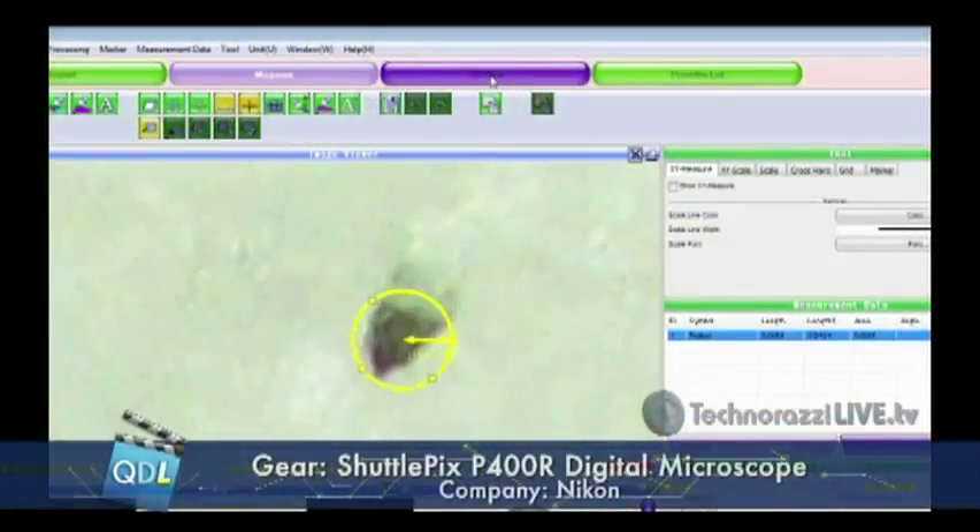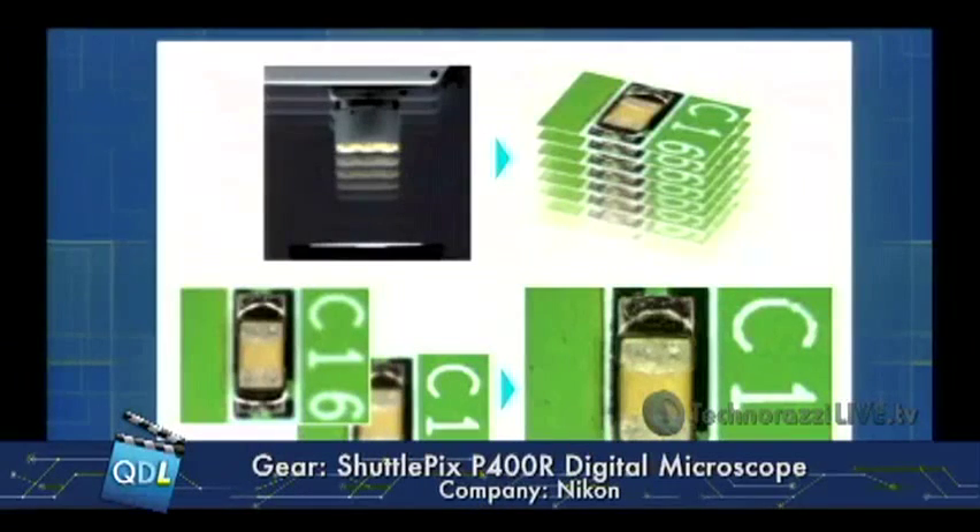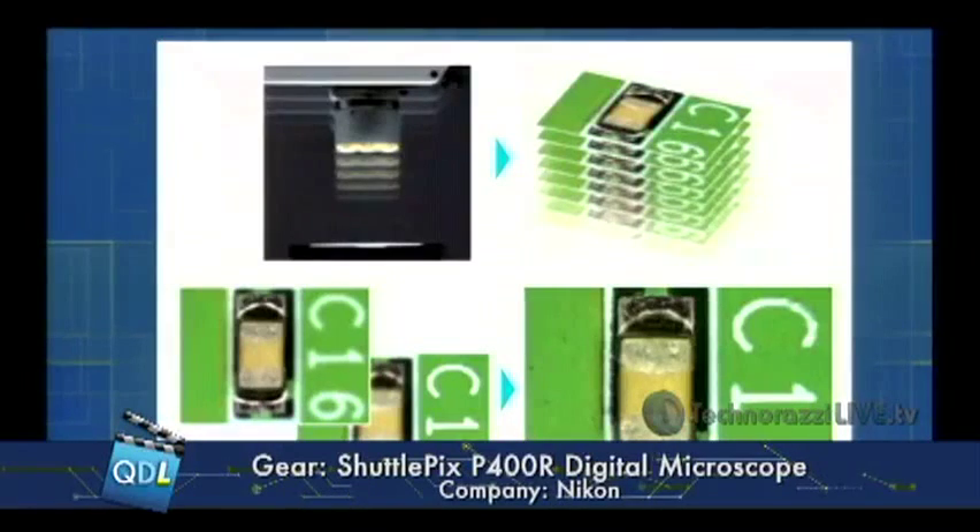The result is an image that is in focus from top to bottom — a true 3D image of the entire object. On the slide you can see multiple images being combined into one fully focused result. Once you have that 3D image, you can perform all sorts of advanced analysis with it.